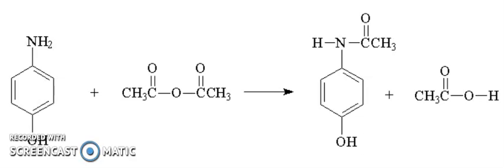Today in this video, I am going to talk about the synthesis of acetaminophen from aminophenol. You know, my friends, para-aminophenol contains impurities and that must be removed at the beginning of the synthesis.